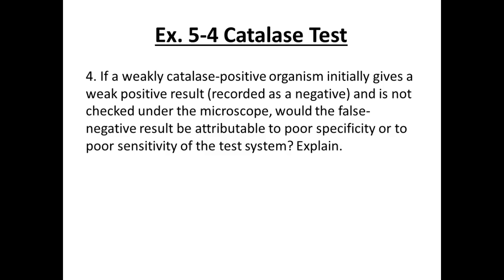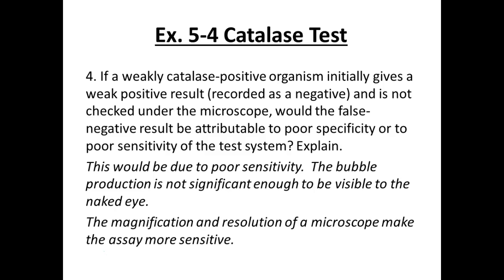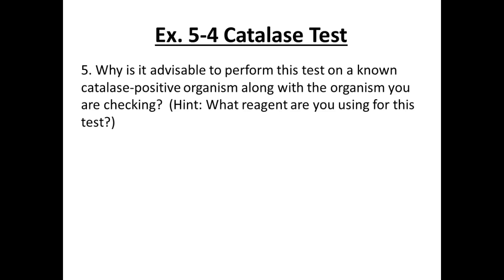So a weak catalase positive, which a lot of times will happen when you're doing it on the microscope slide because it's hard to visualize. Sometimes those bubbles are really hard to see, so you might not see them, and you record this as a false negative result. Is this poor specificity or sensitivity? Sensitivity, right? It's difficult for you to visualize. That's a sensitivity issue. Maybe viewing it under the microscope would help. But we do the slant test with lots of bacteria, right? As a backup.